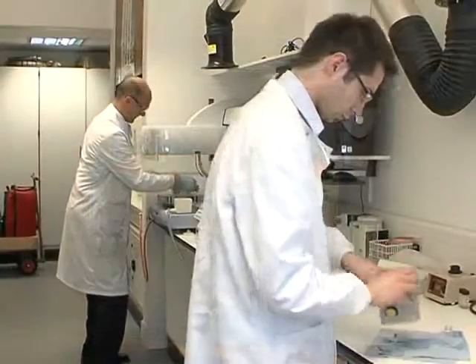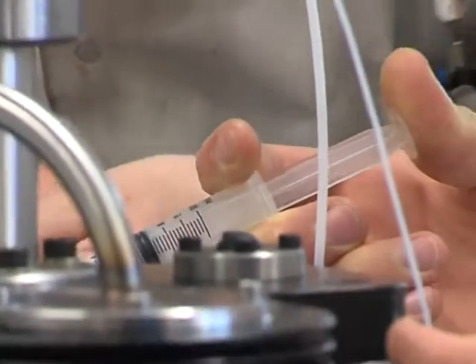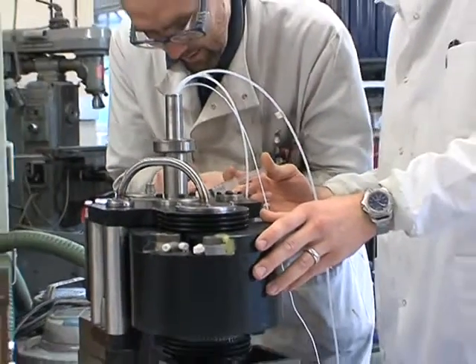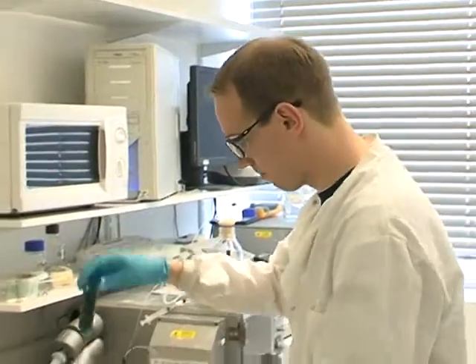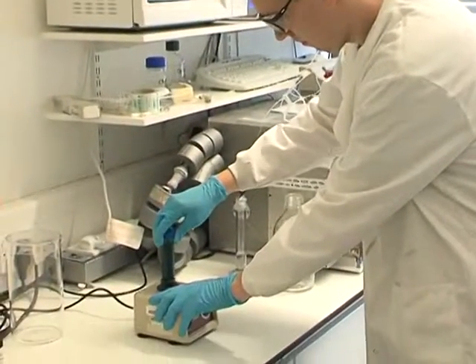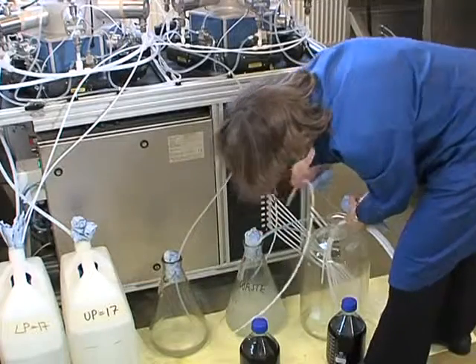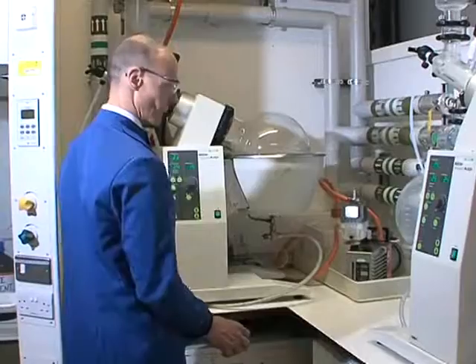Research into countercurrent chromatography and its applications is a major part of the work at the Brunel Institute for Bioengineering. Scientists and engineers at the institute have taken the previously unreliable and slow technique of countercurrent chromatography and turned it into a fast, modern, and effective approach suitable for direct scale-up to industrial levels.